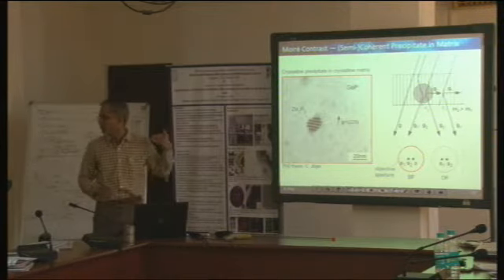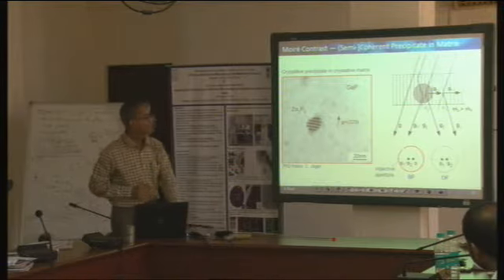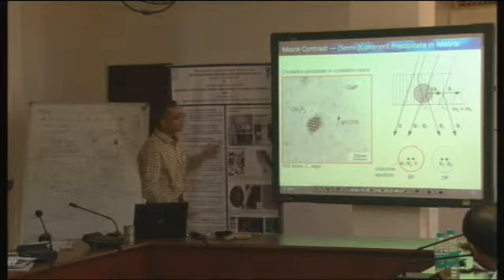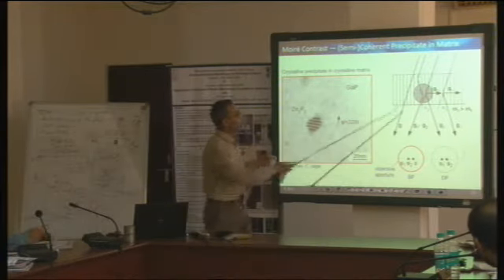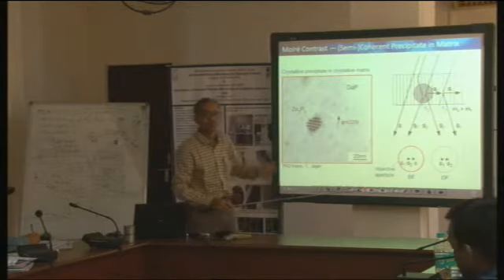So I think mass thickness and diffraction contrast is finished, and we now go to moire fringes. Suppose there is a precipitate and there's a matrix, and this also scatters. It gives rise to a diffracted beam of its own.